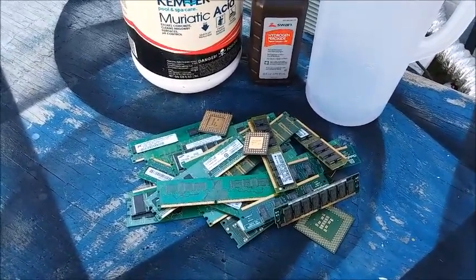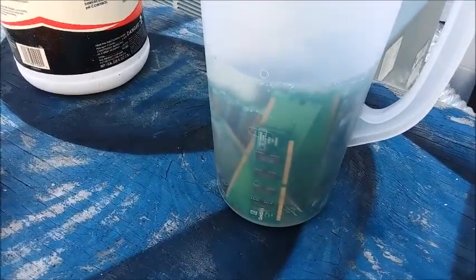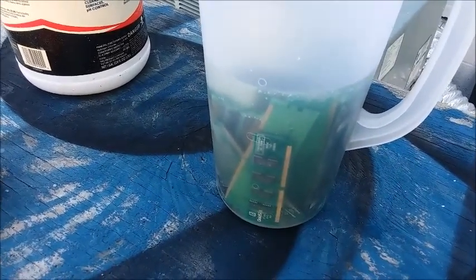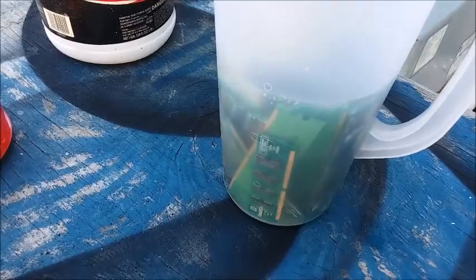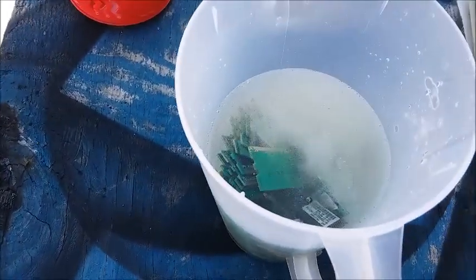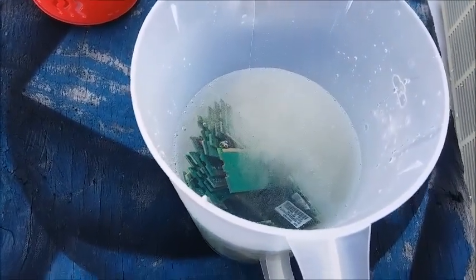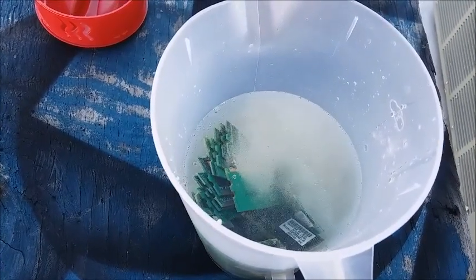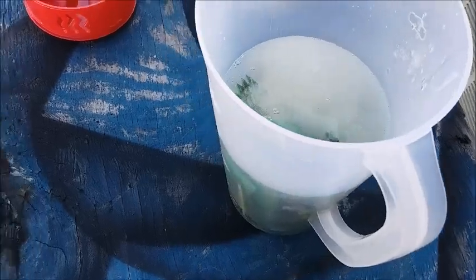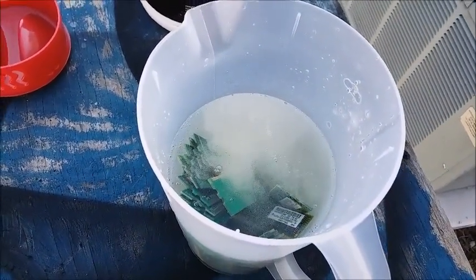Okay, everything is in the container. I filled it about halfway up with muriatic acid and then topped it off with the bottle of hydrogen peroxide. We've got some serious chemistry going on — there's a lot of bubbling, so it's obviously dissolving the metal and liberating hydrogen gas. The liquid is also starting to take on an ever so slight green color, so I imagine it's dissolving some copper.